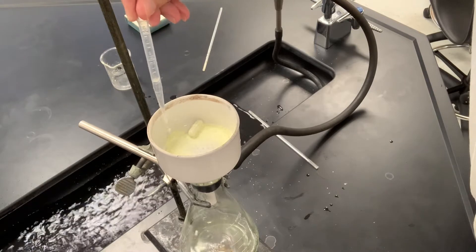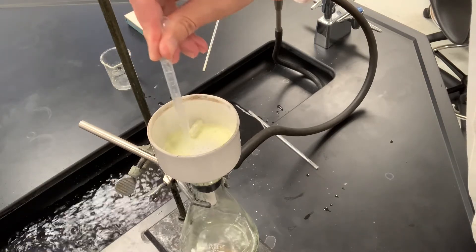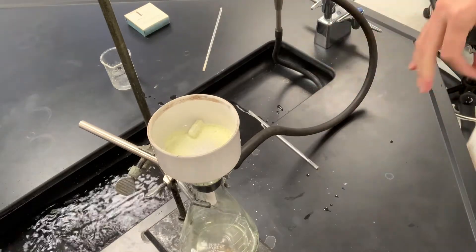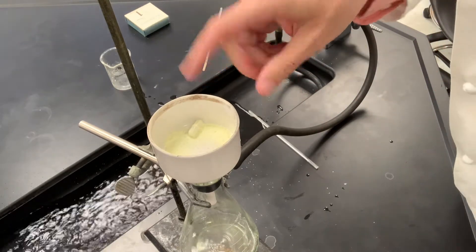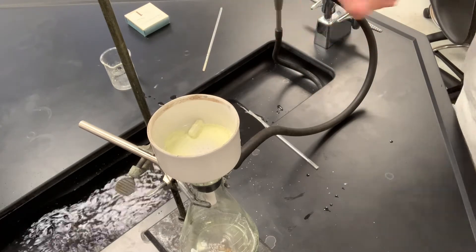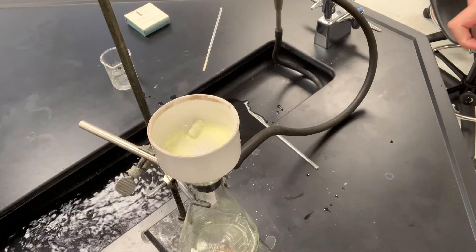That's a total rinse of about 10 to 12 milliliters. We'll let the vacuum pull through the crystals there to pull any adjacent water through, and then air dry for five minutes or so. Then we'll set this aside to dry overnight until the next lab period.